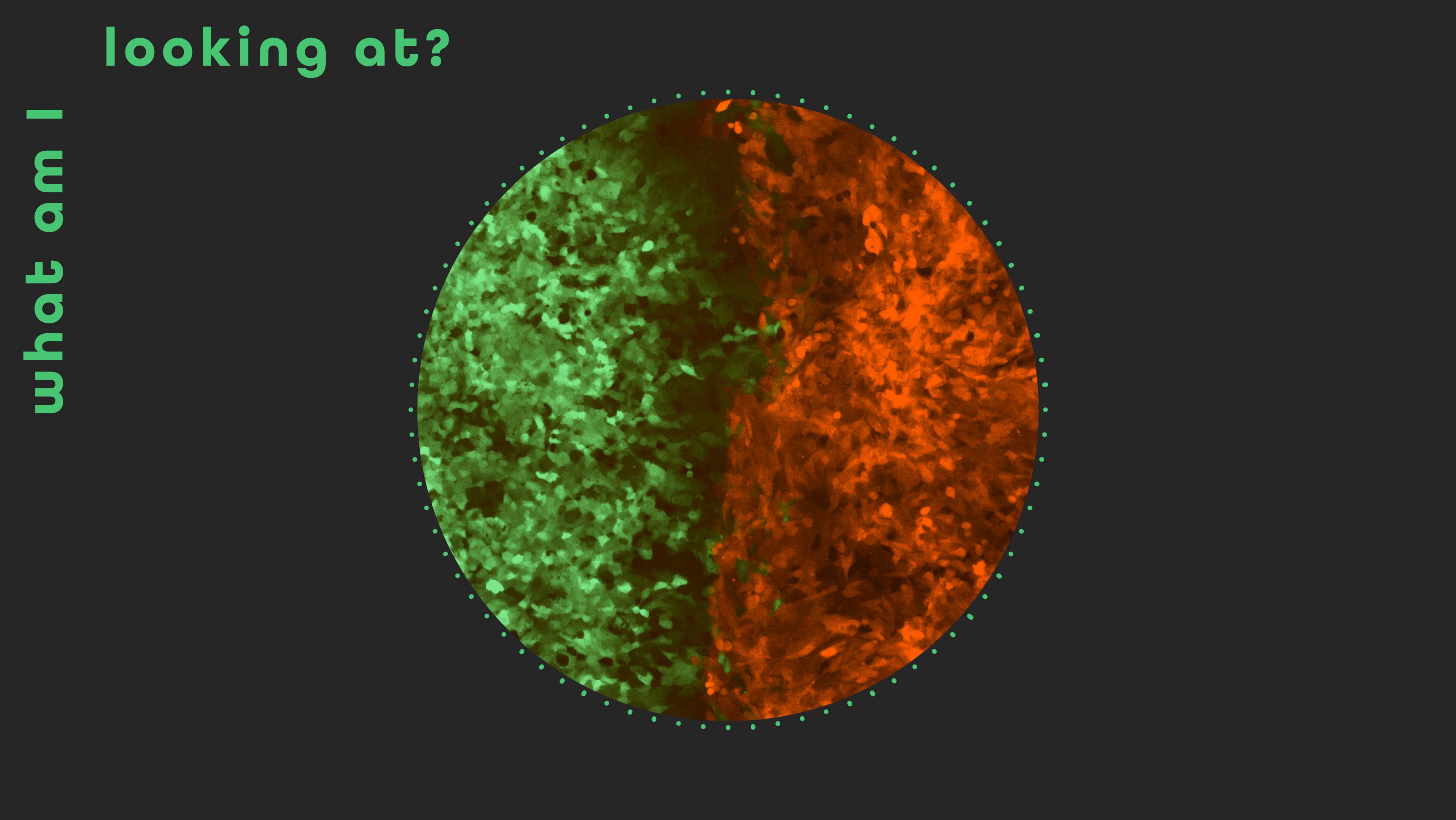This image captures the moment when the red cancer cells breach the front line, pushing forward into the epithelial cell layer.